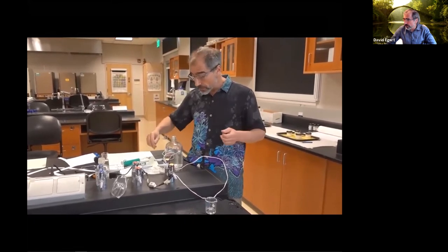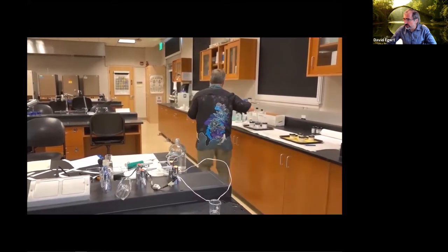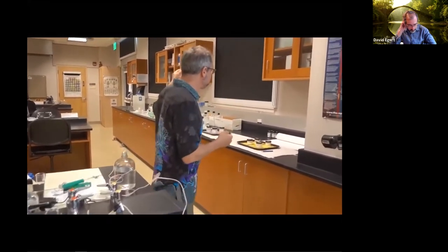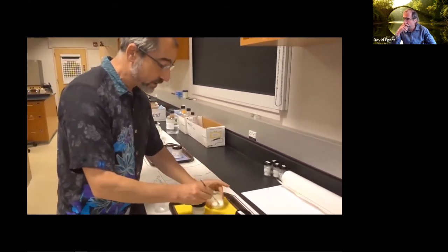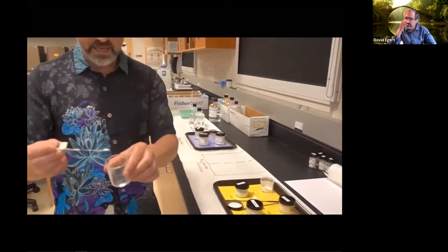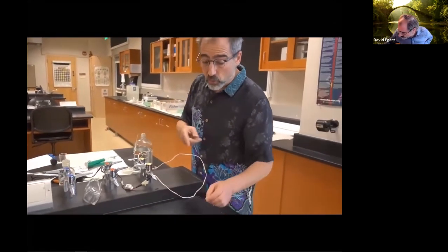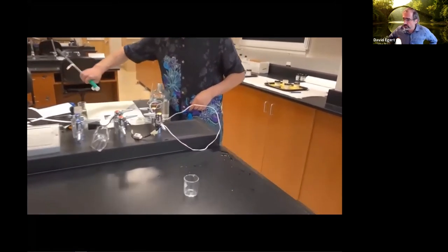So let's do that. Again, I'm going to take one of my little beakers. It doesn't matter which electrolyte I pick. I'll pick salt, because table salt is the one I'm most familiar with in my life. I'll take a pinch and add it into my little beaker. I don't need to label this because it's only one electrolyte. So this is the salt. If you take a look at it, it looks like salt.